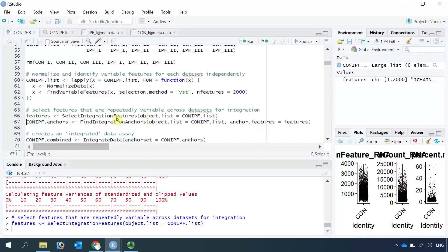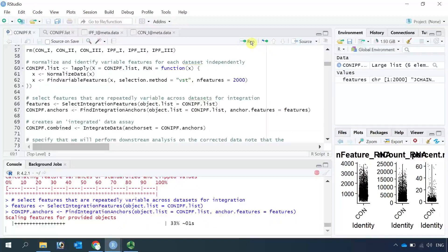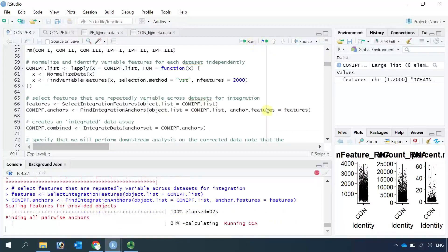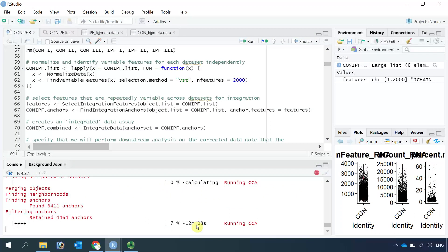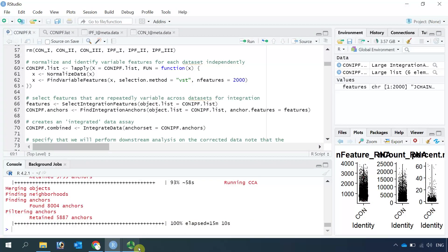Then we can use the FindIntegrationAnchors function to find the anchors between each dataset. It takes more than 12 minutes to find the integration anchors among six datasets. After finishing, you can see it found 8,004 anchors. After filtering, it retained 5,887 anchors.